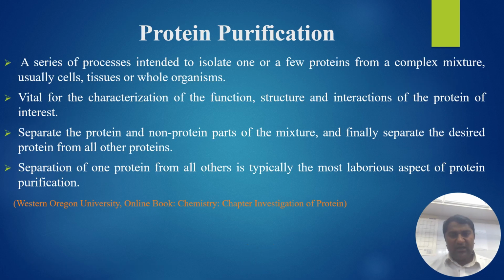So first of all, you should know what protein purification is. It is a series of processes intended to isolate one or a few proteins from a complex mixture, usually cells, tissues, or whole organisms, vital for characterization of function, structure, and interactions of the protein of interest. It separates the protein and non-protein parts of the mixture, and finally separates the desired protein from all other parts.